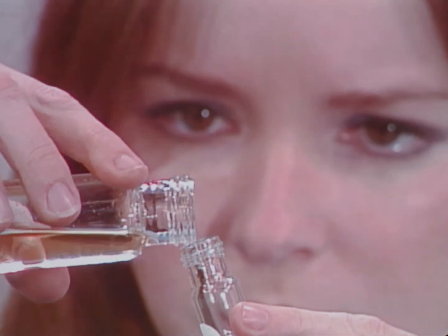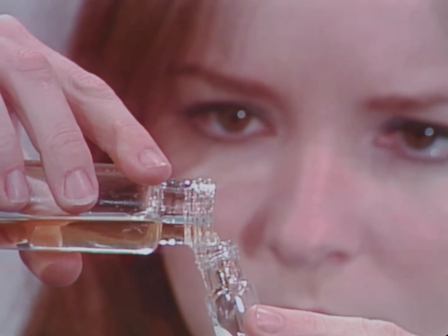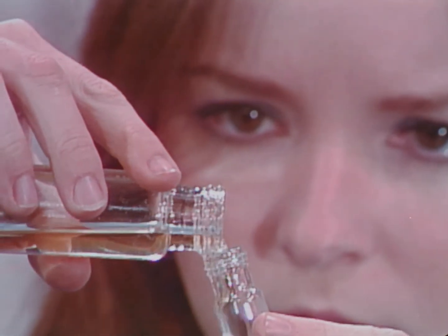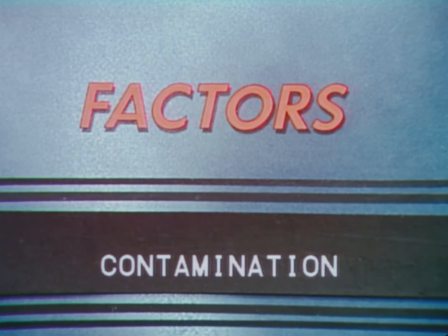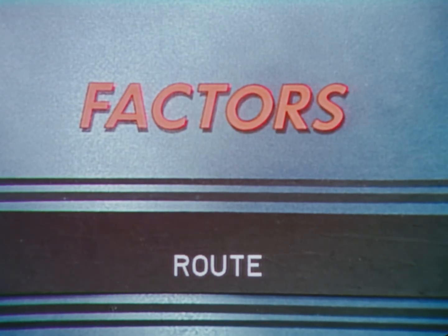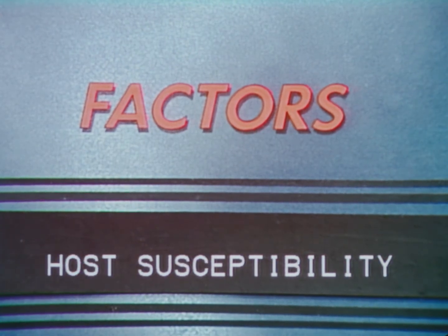4 factors determine whether you, the laboratory worker, will become infected by contact with large or small droplet aerosols. Factors determining infection are extent of contamination, route of infection, virulence of the organism, and host susceptibility.